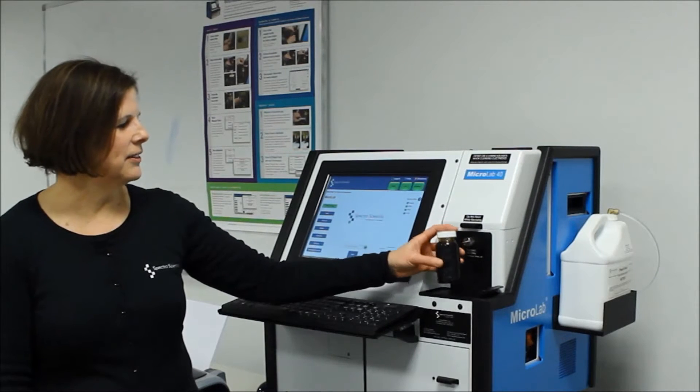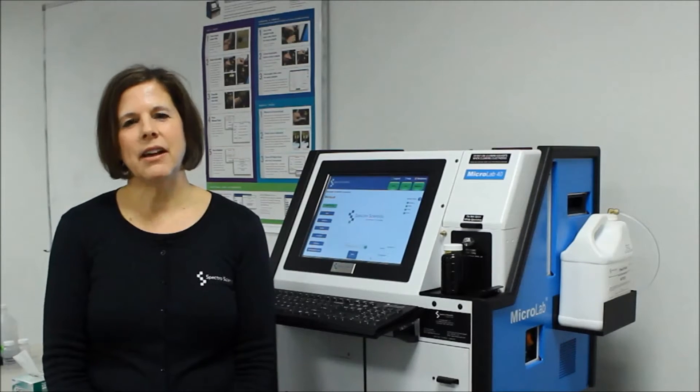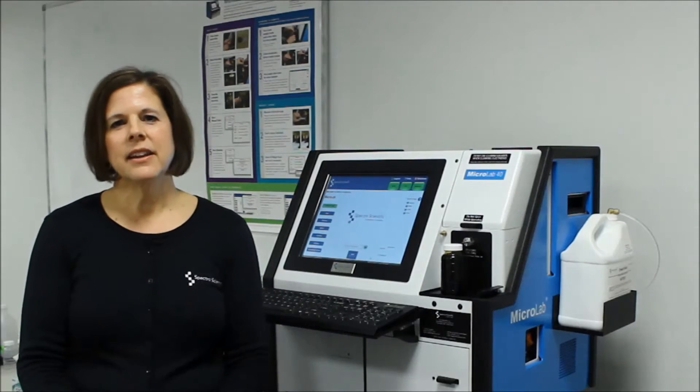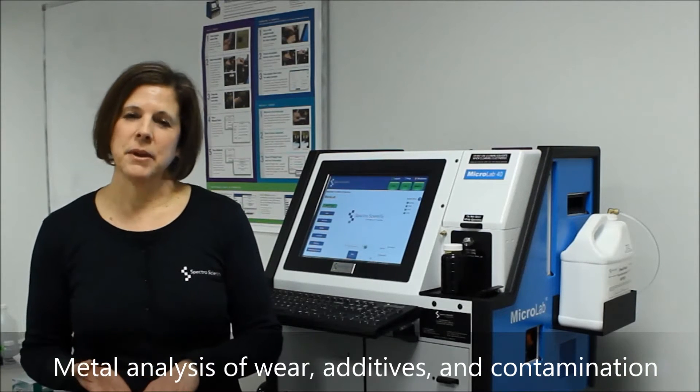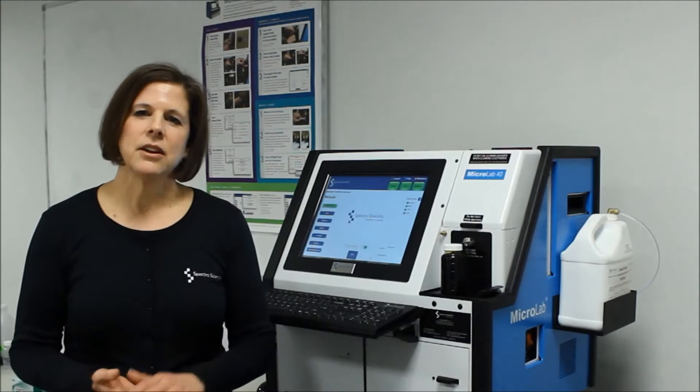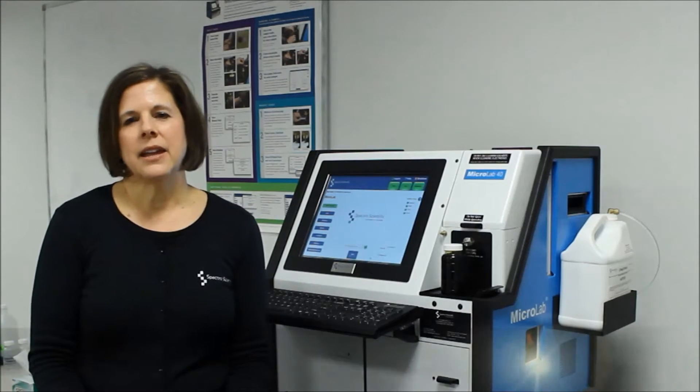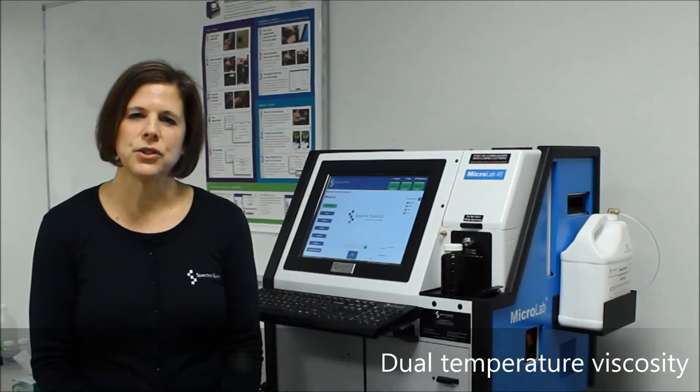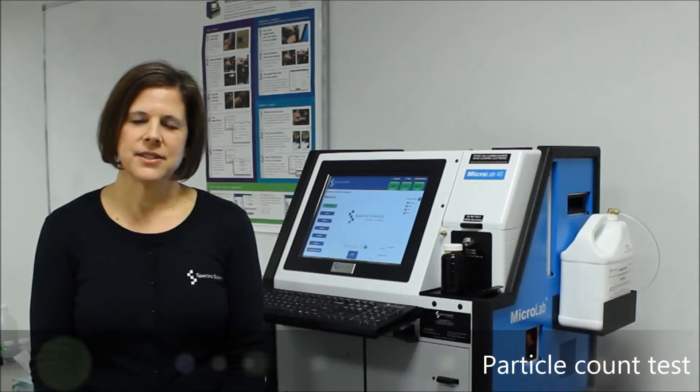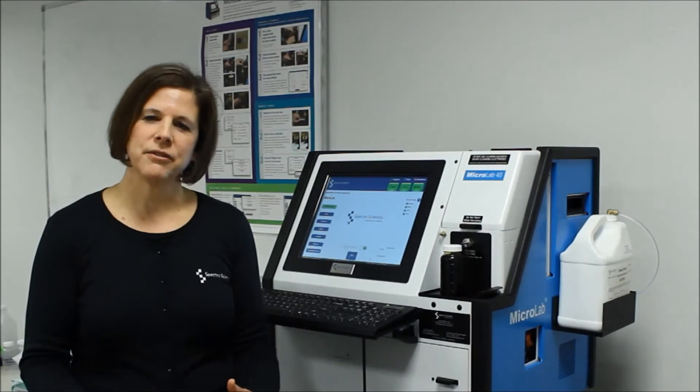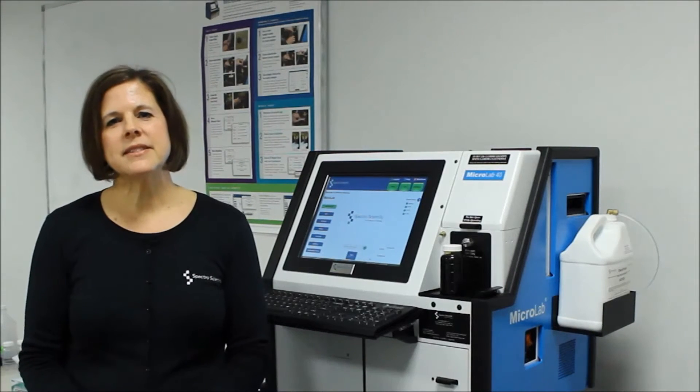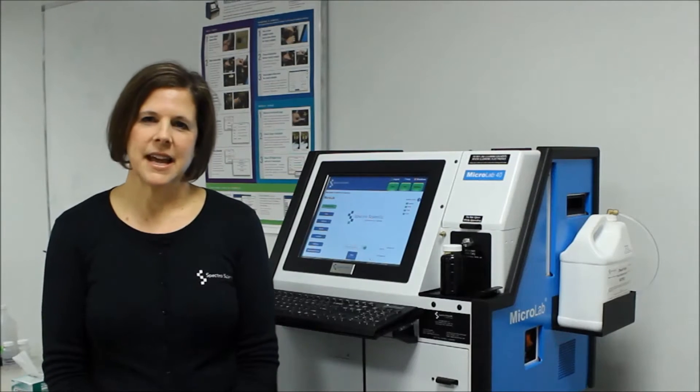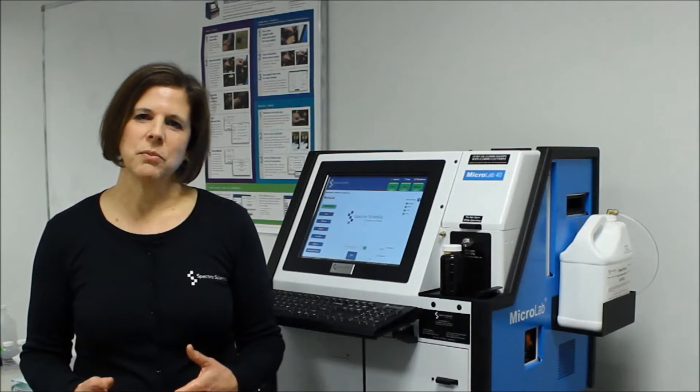With just a 5-ounce bottle of sample, the Microlab provides all of the parameters found on a typical oil analysis report from a laboratory. This includes metal analysis of wear metals, additive levels, and contamination elements of up to 20 different elements. It also includes 6 different parameters for oil chemistry, giving the complete picture of oil health and condition. Viscosity is given at 2 different temperatures, 40 and 100 degrees Celsius. And in the Microlab 40 version, you also get particle count tests. The Microlab translates all of the data from those tests into an easy-to-understand report, which includes color-coded alarm limits as well as diagnostic statements for maintenance actions. This gives you on-site oil analysis capability and real-time decision-making capability.